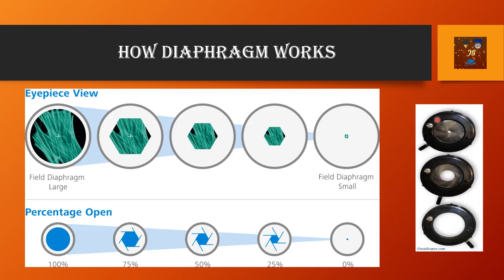How does the diaphragm work? This is the diaphragm in the compound microscope. This is the minimally open diaphragm, this is 25 to 50 percent open, and this is the fully open diaphragm. This rod-like structure is the device by which we can open or close the diaphragm. When the diaphragm is 0% open, you can see only a small view; at 25% open, that much view can be seen; at 50%, this is the view; at 75%, that is the view; and at 100% open, there is a full view.